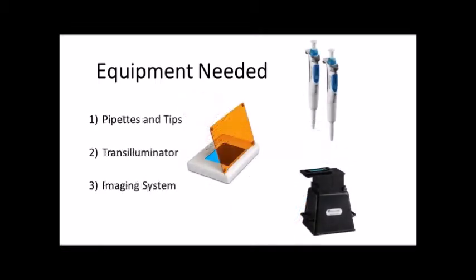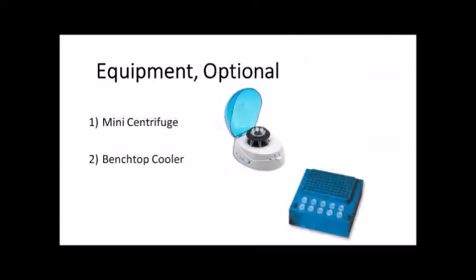Additional equipment needed includes pipettes and pipette tips, a transilluminator, and an imaging system if you want to take any pictures of your resulting gel. Some optional items include a mini centrifuge for spinning down small amounts of reagents, and a benchtop cooler for keeping temperature sensitive reagents cold on the lab bench.